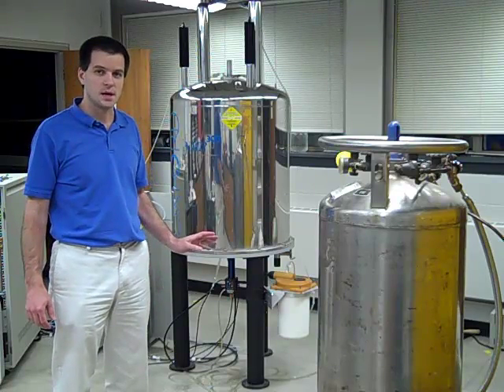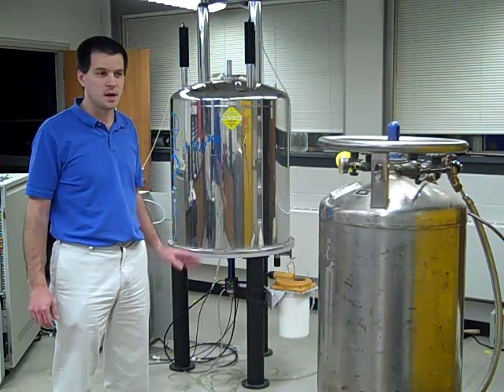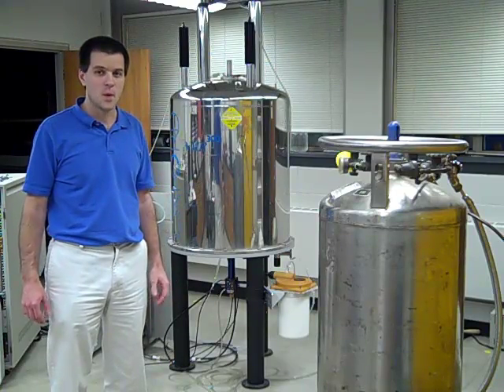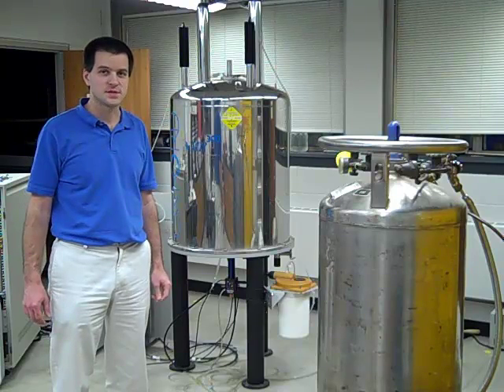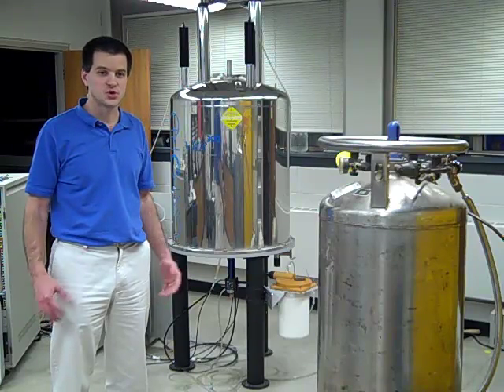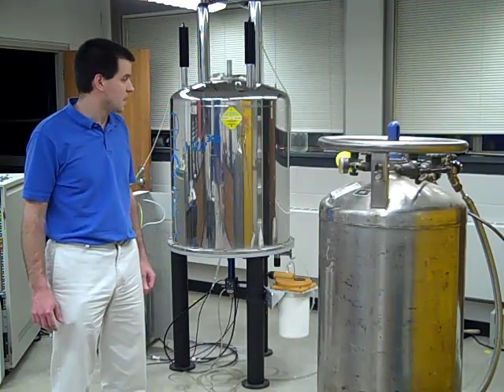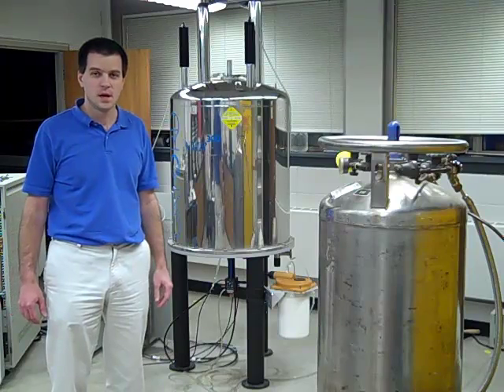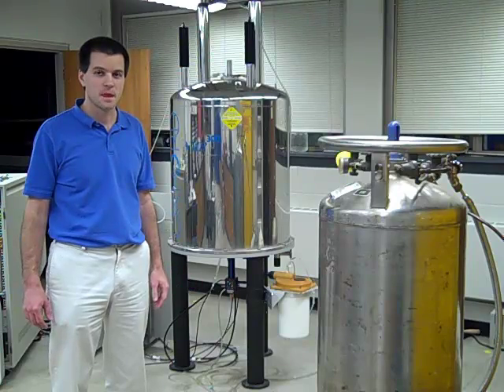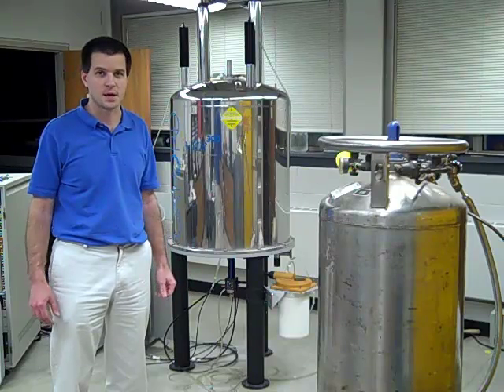One of the important new features of this instrument will be the installation of an autosampler and web-based software that will allow students to access their data really from anywhere and control the instrument to analyze their samples really around the clock. Also in this particular room are located Fourier Transform IR spectrometers, which are also used in both research and coursework for characterization primarily of organic compounds.